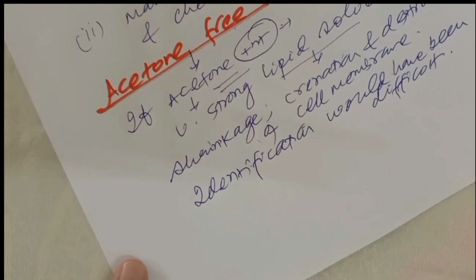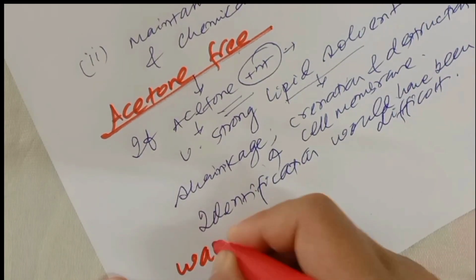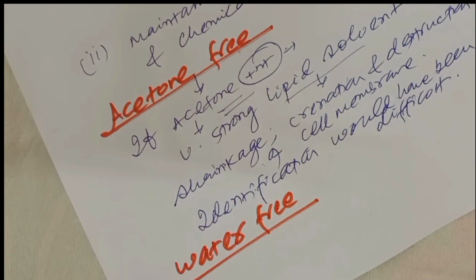Then the second point is that the methyl alcohol should be water free also. But why should it be water free?